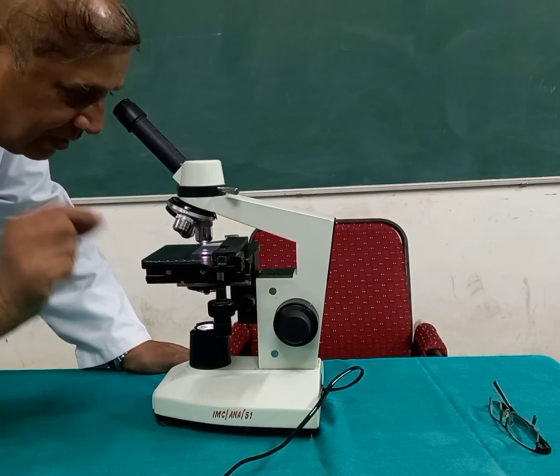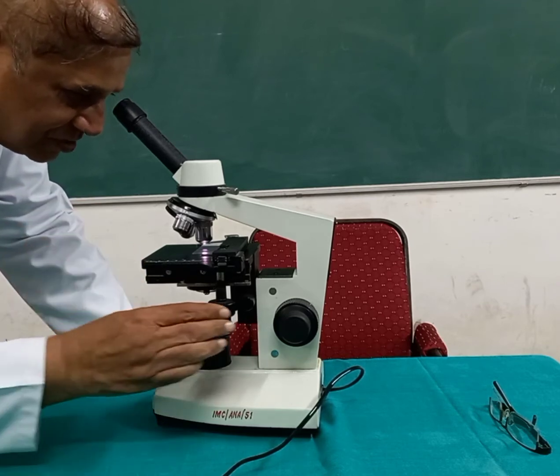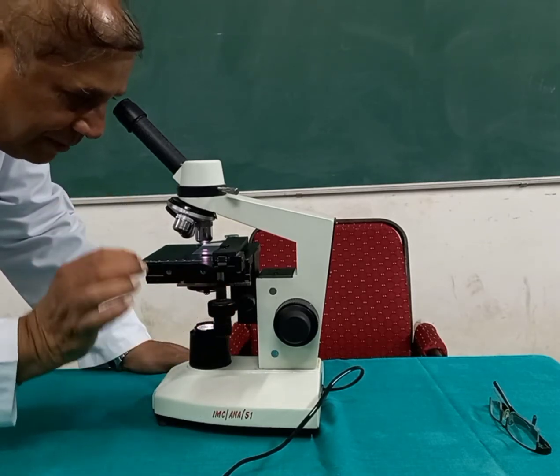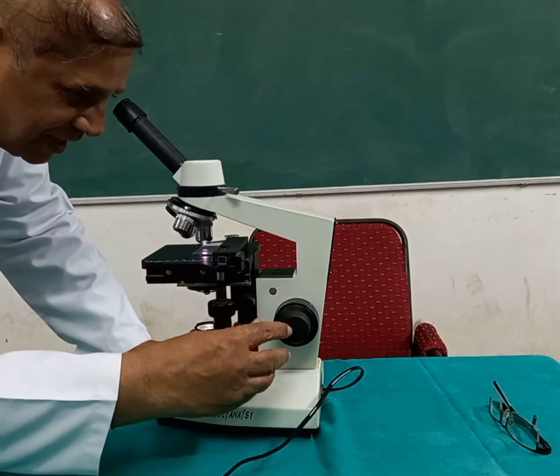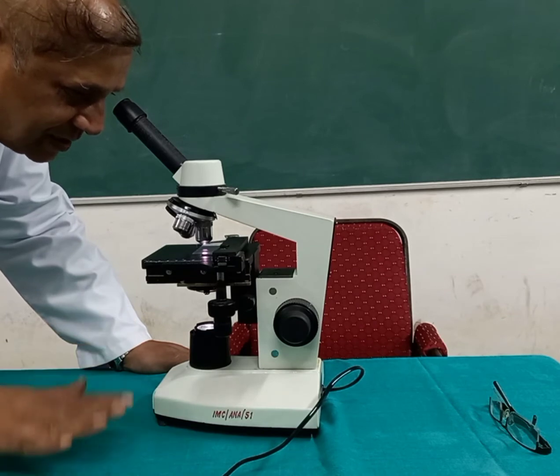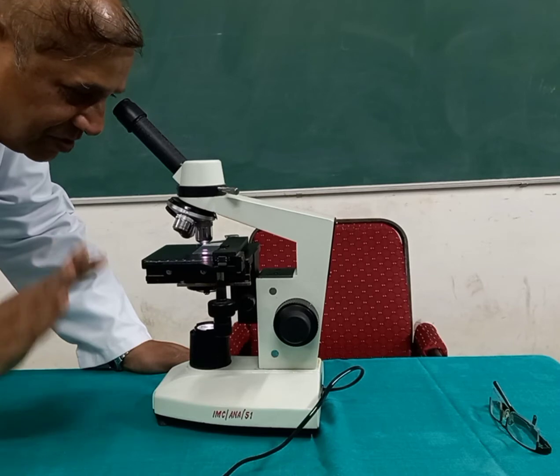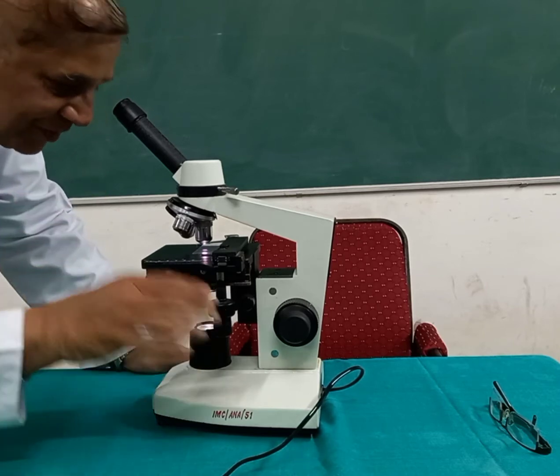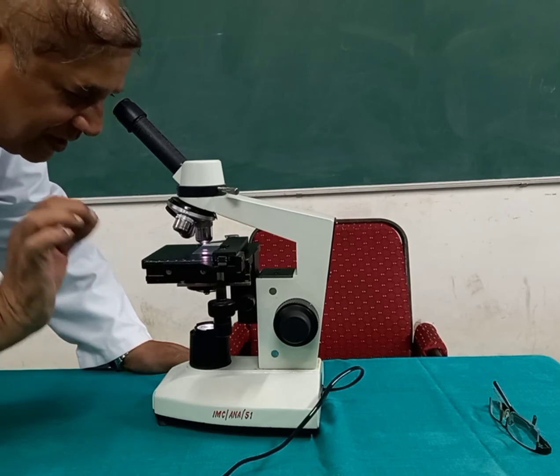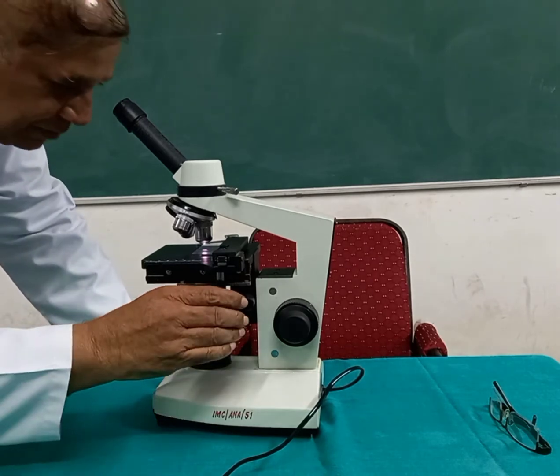The more light will be there when the condenser is up and the iris or the diaphragm is open. So try to adjust the appropriate light with the diaphragm and condenser. How will you define that this is the perfect light? That means you should see a sharp image. You should not go for the bright image. You should go for the contrast. The sharp image should be seen, which will give you more detail in comparison to when bright light is there.